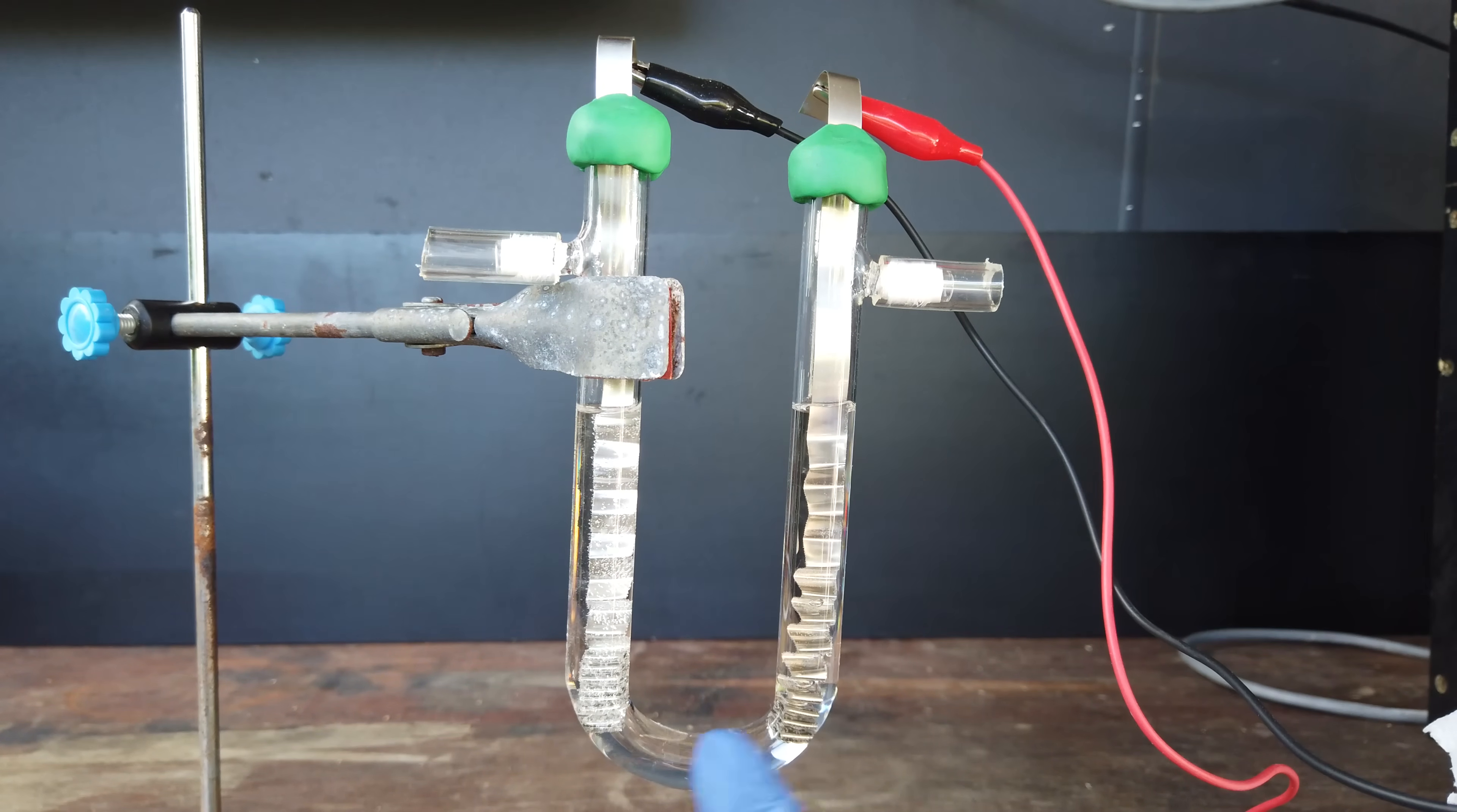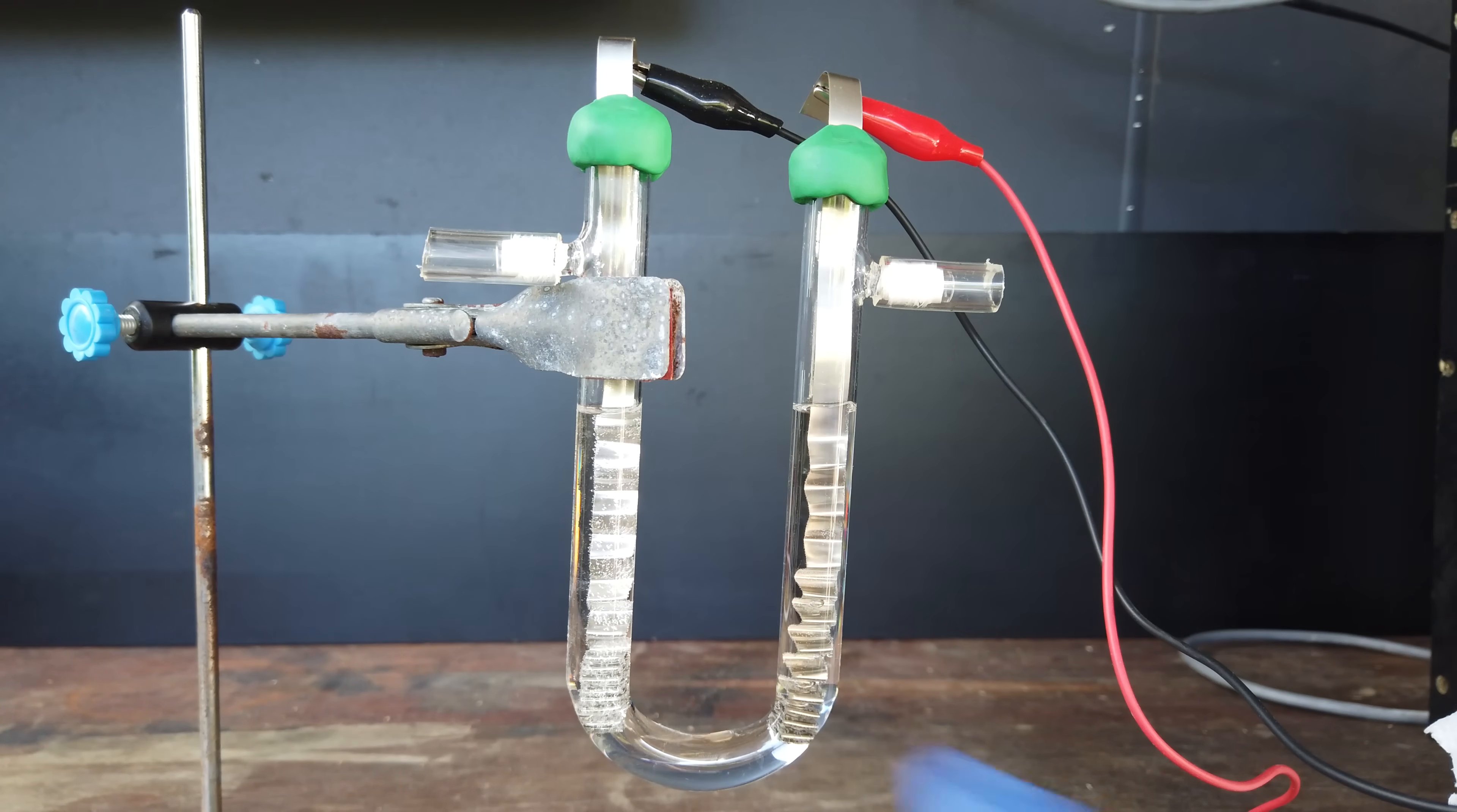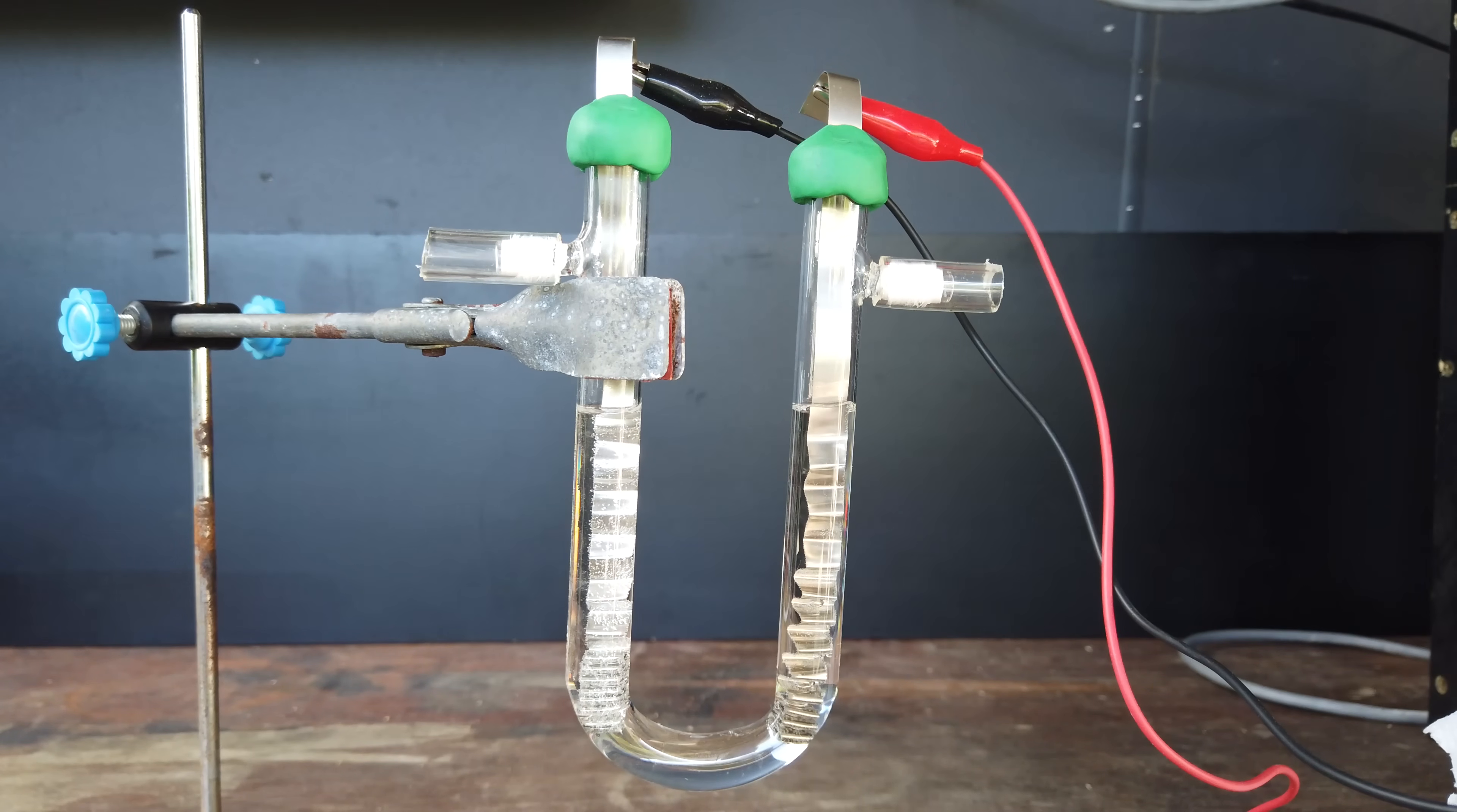As you can see, at this 1.5 volts, we are generating hydrogen off the cathode. You can see that bubbling off the electrode rather quickly there. We have about 6 milliamps flowing through the cell right now. So that's not much gas production, but you can definitely see it there.